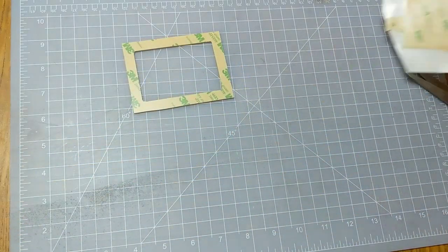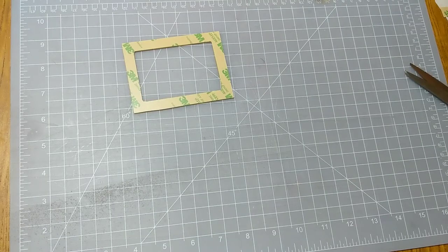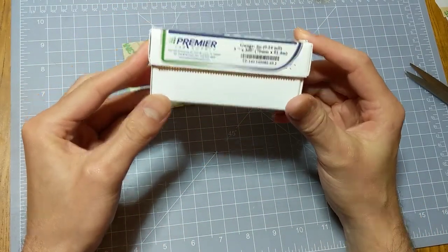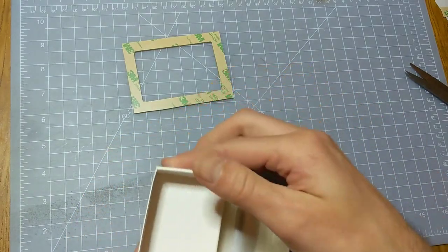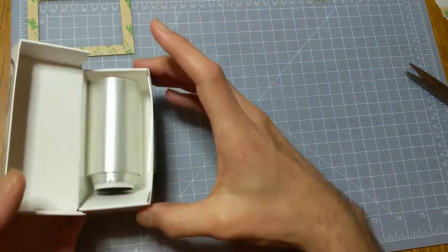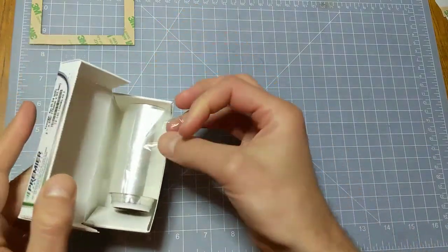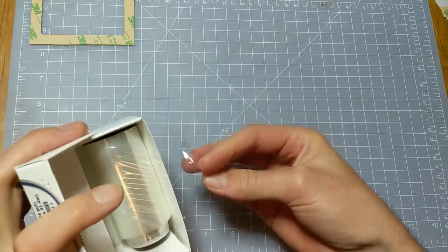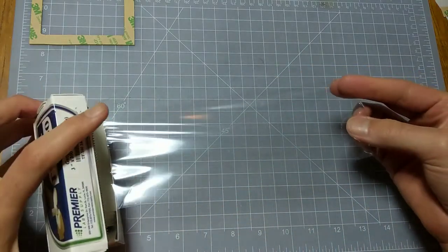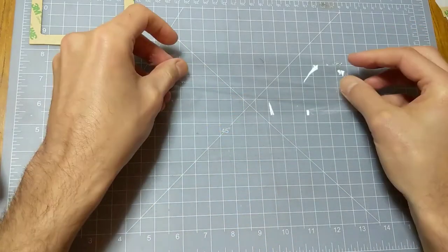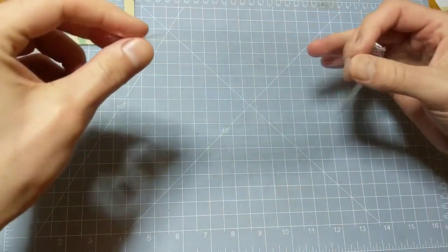So now that's ready for the mylar film. Premier Lab Supply sells a 6 micron mylar film on a roll that's just the right size to cover the frame. I start by taping the mylar down to a work surface. We want to get a nice flat, taut surface of the mylar, so it needs to be tight.